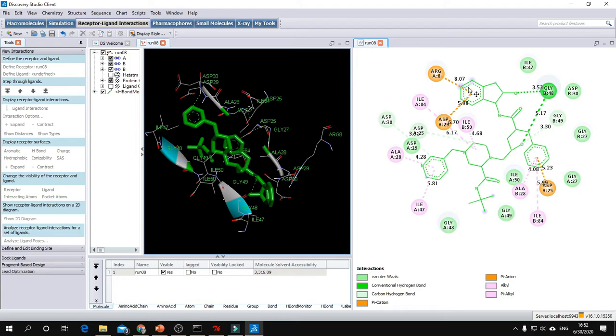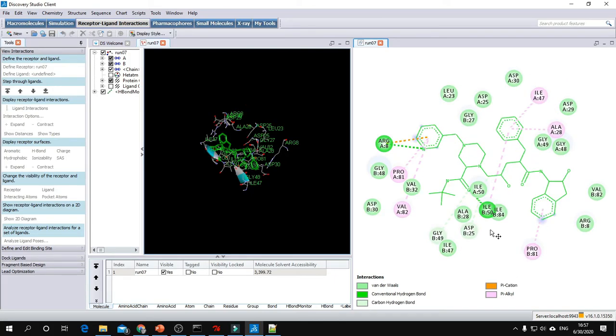This energy of -11 and these interactions are for the control molecule Indinavir, which has also formed two conventional hydrogen bonds and one pi-cation bond. The rest are pi bonds, van der Waals, and carbon-hydrogen bonds.